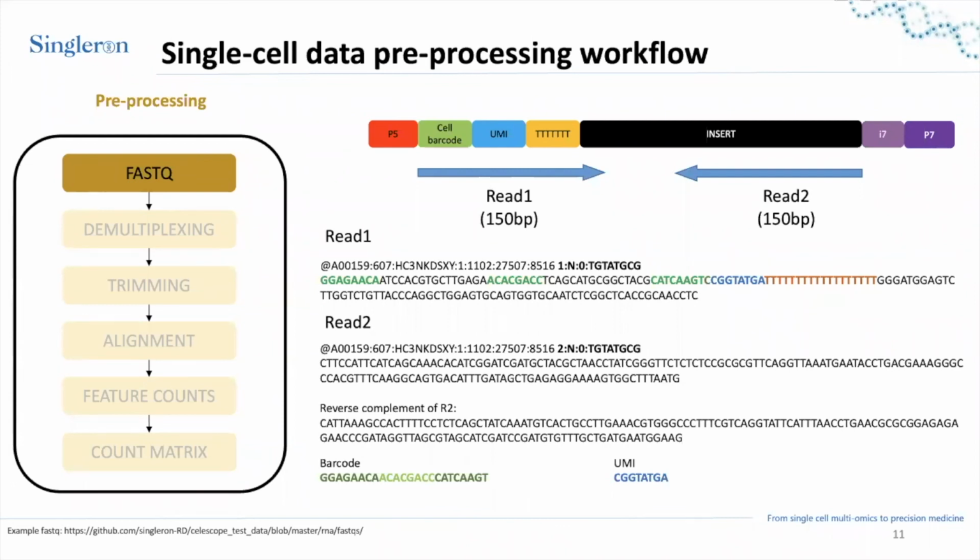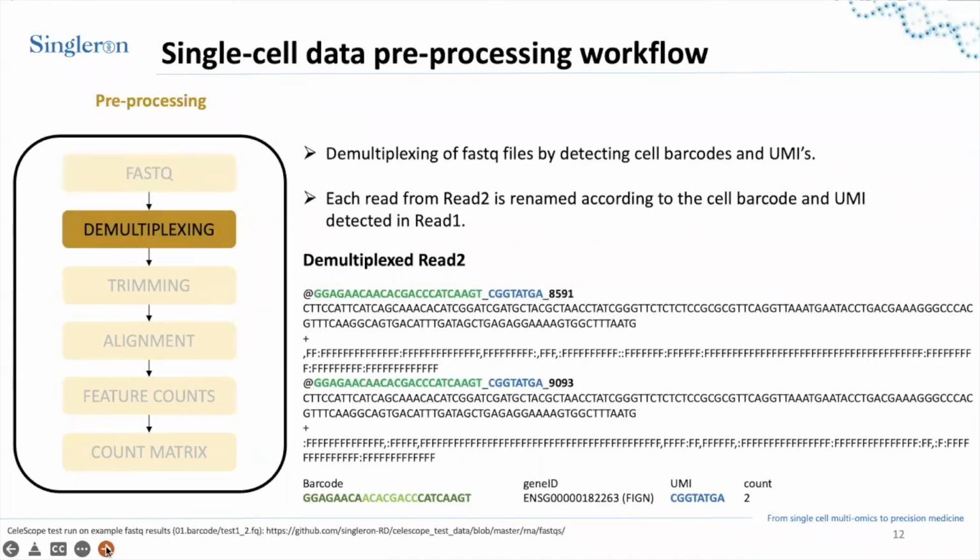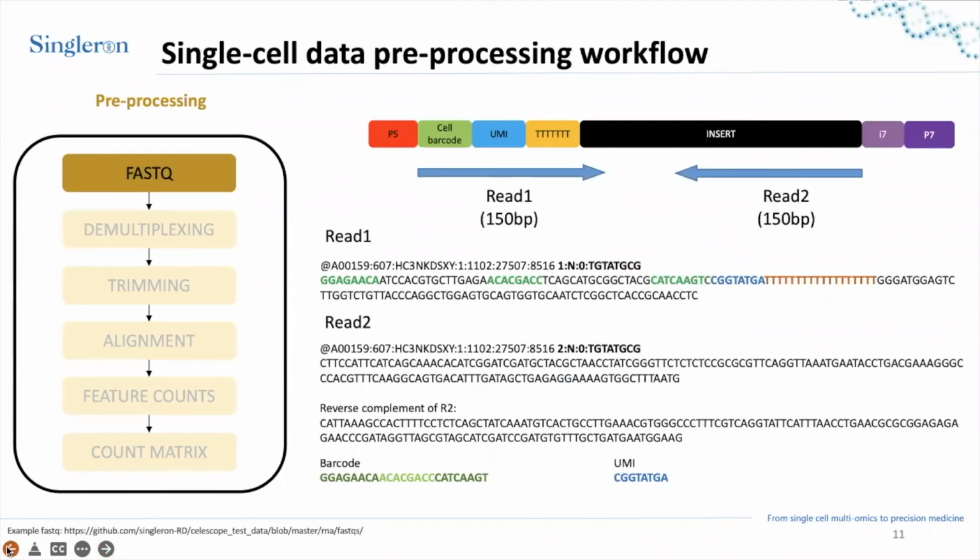The process of demultiplexing and Fastq file generation can be very slow. Is there a faster and more efficient platform or approach to use? Okay, that's a good question. So far, the process is slow.